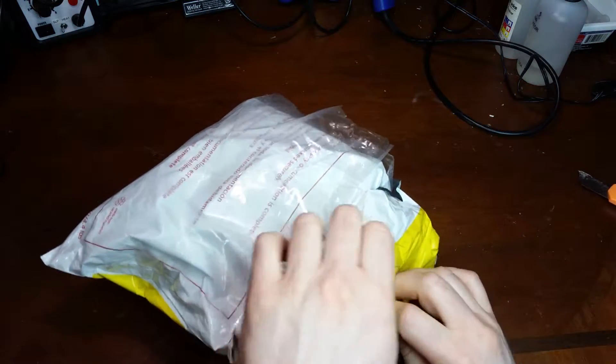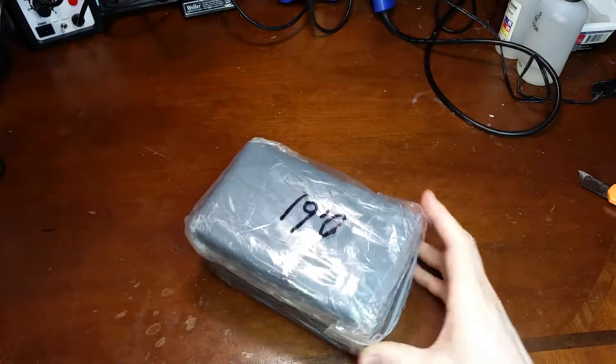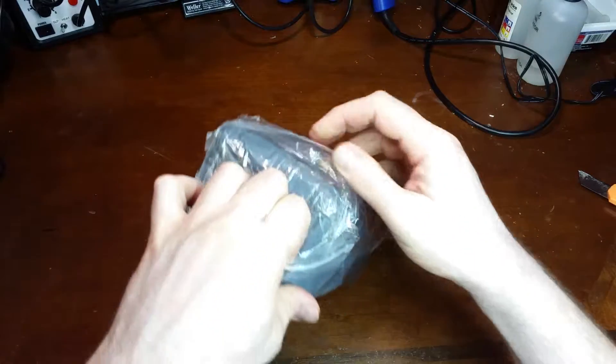And since it is directly from China, you never really know what you're going to get. So we'll see if it is as good as it's supposed to be.